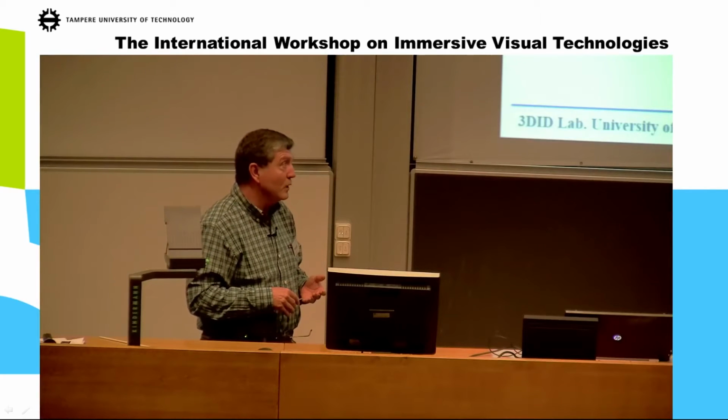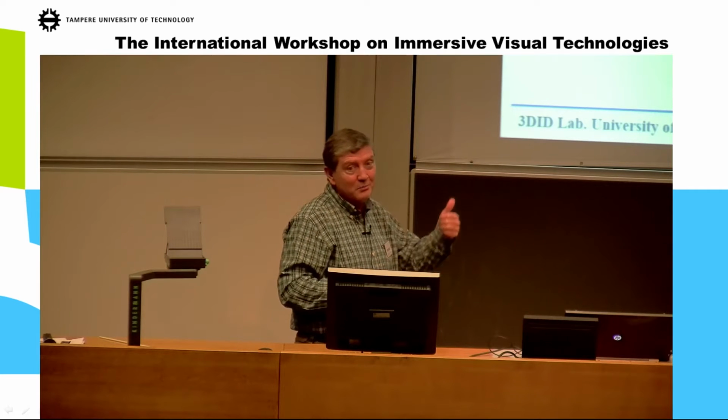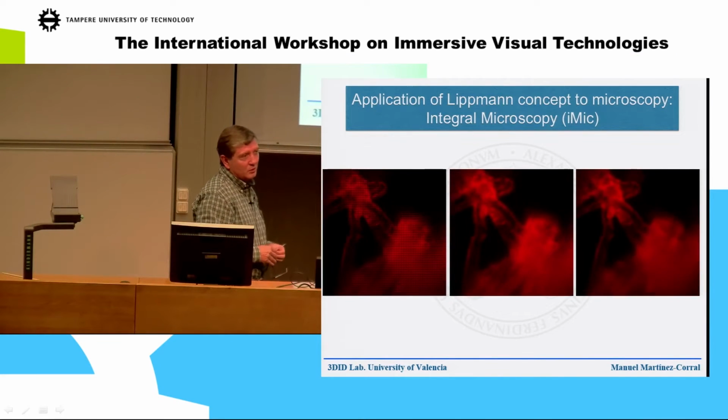The main problem is that we lose resolution. Losing resolution is always a big problem, but in microscopy it is a key problem. So, in fact, if you lose resolution, this cannot work. If you are implementing a technique in microscopy which is losing resolution, nobody will accept that.